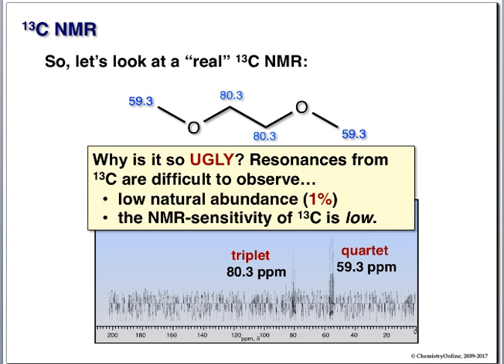Carbon-13, you have a tiny fraction of excess with the field as opposed to against. So low sensitivity, low concentration, really, really nasty spectrum. Well, with a modern machine, you can run this over and over again. You collect the data over several thousand runs, and then you analyze it, you average it, etc., and you can resolve the quartet and the triplet better.